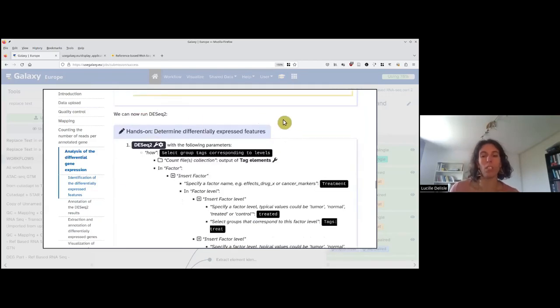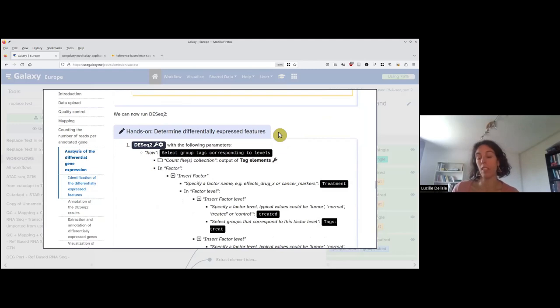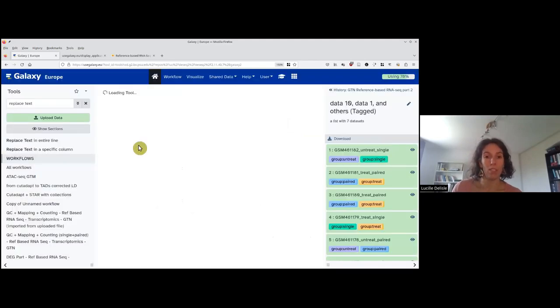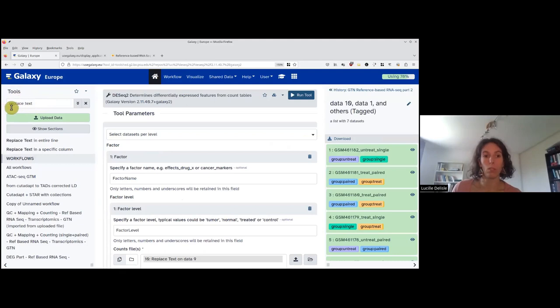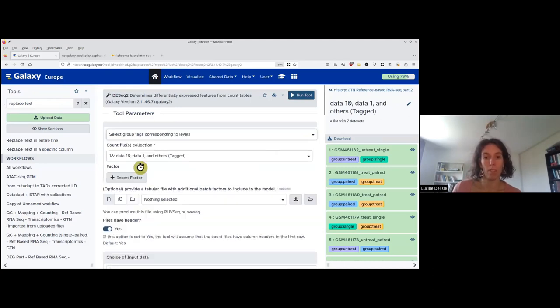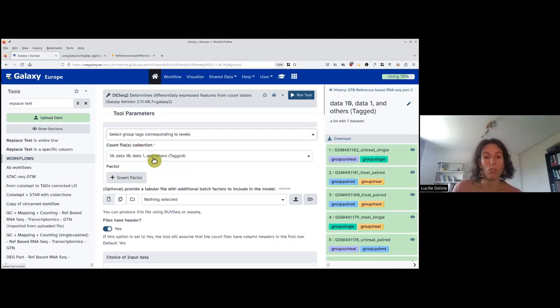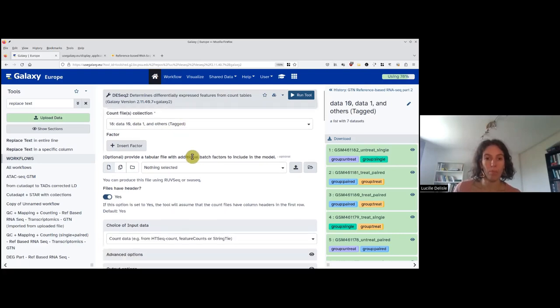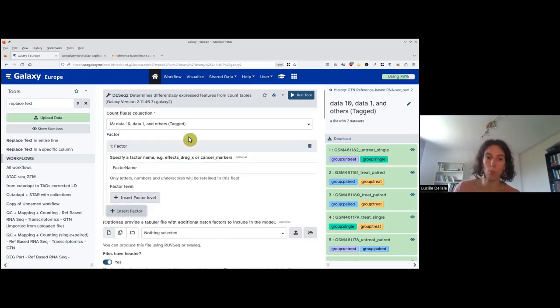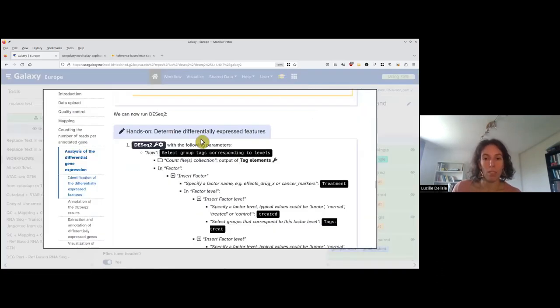We will run DESeq2, which is an algorithm that allows identifying genes that are significantly differentially expressed between two conditions or more. We click on the DESeq2 tool, which you can also find via the tool search. We will select 'group tags with levels.' This is why we put these tags. For the count file collection, we need to choose the collection that has the tags. We specify which are the factors — the differences between the groups.